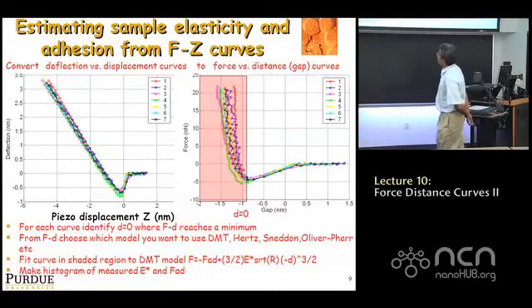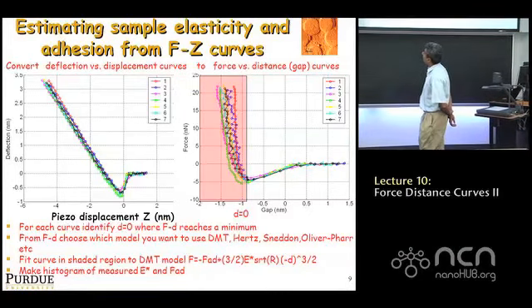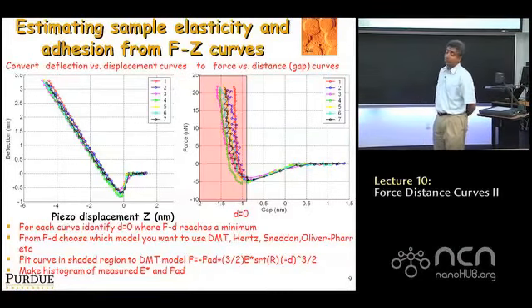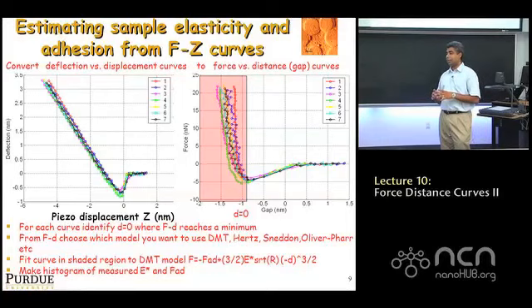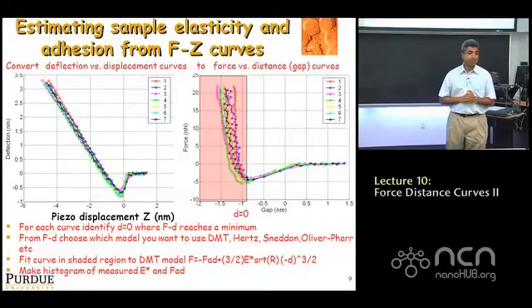On the top right, you actually see a topography image, and the circular objects are actually cross-sections of carbon fibers that are typically 2 to 3 microns in diameter, and filled in between them is a epoxy, a material that binds everything together, right? So this is the kind of stuff that the Boeing Dreamliner, for example, is made of.